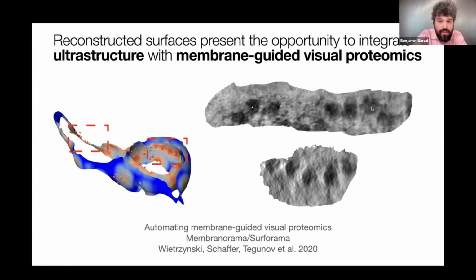But now that you're looking at this way, hopefully it becomes clear, oh, they're forming this long line. They're not just randomly distributed on the membrane. And we think what you're seeing here is multiple ribosomes processing the same long piece of mRNA. So you're seeing translation of these membrane proteins by ribosomes into the ER membrane directly.